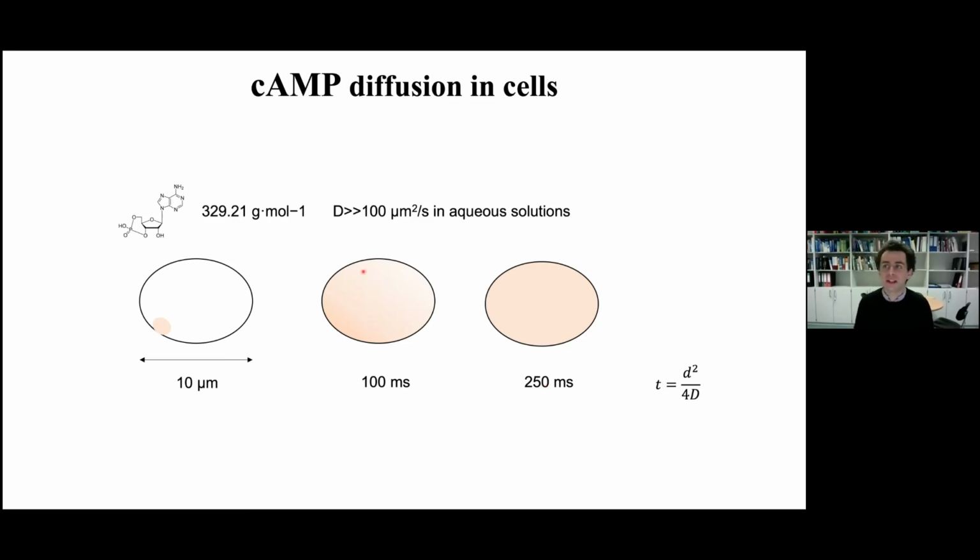So one could have said, well, maybe one receptor is here, the other receptor is here. So if you stimulate the receptor here, the signal stays local here. If you stimulate the receptor here, the signal will stay local here. This is most likely not the case. So there has to be another way, because this thing is too fast.